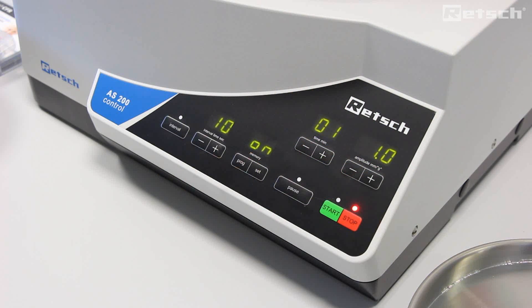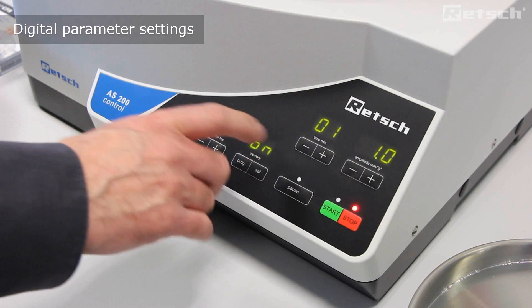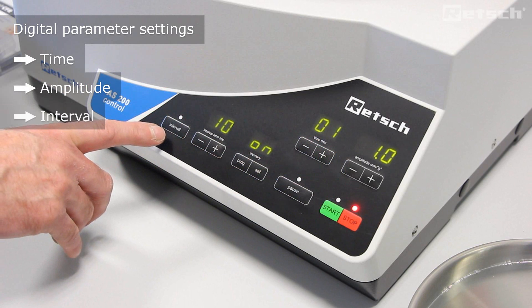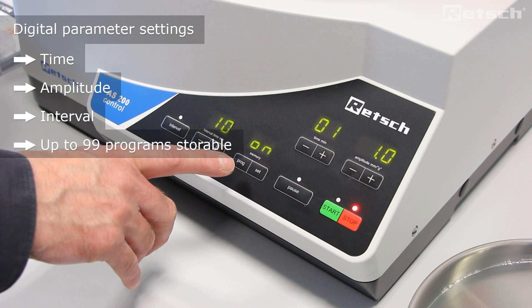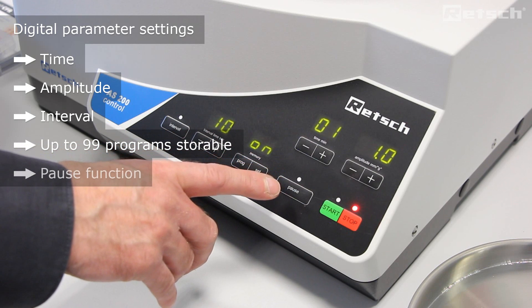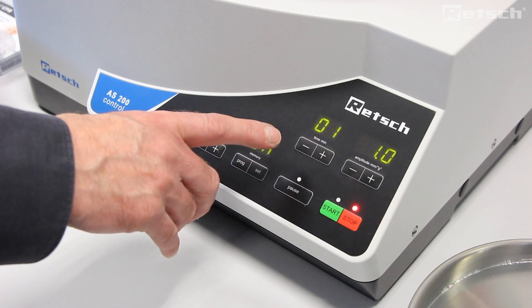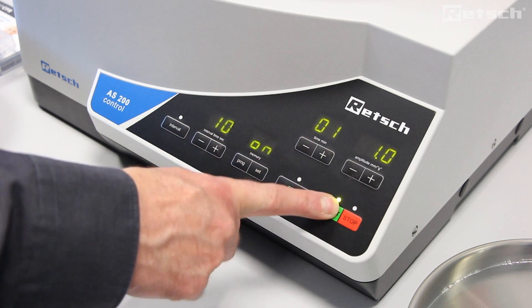The AS200 control allows for all parameter settings to be set digitally for the purposes of reproducibility. Here we can see the parameters of time and amplitude. We can set an interval, change the interval setting, store up to 99 programs, and pause the sieving operation at any point. Once the time and amplitude settings are configured, we can simply press start to begin the sieving operation.